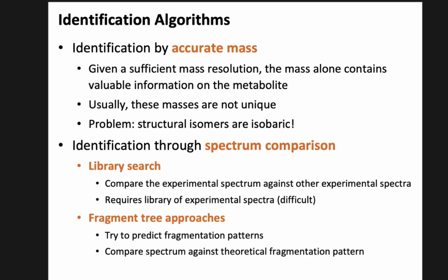But oftentimes you don't go this full length. At some point you draw the line and say, well, I'm reasonably confident these 20 compounds, there are going to be this, or this. And if you then really want to get a patent on the biomarkers, then you would probably go the full length and really make sure that you have found everything. But for the publication, it might be enough to just have a decent identification list. All right.